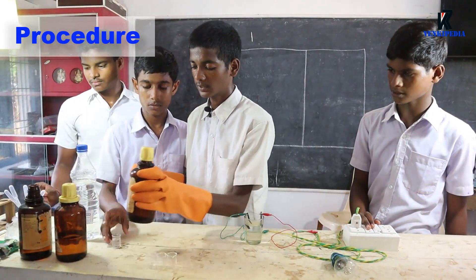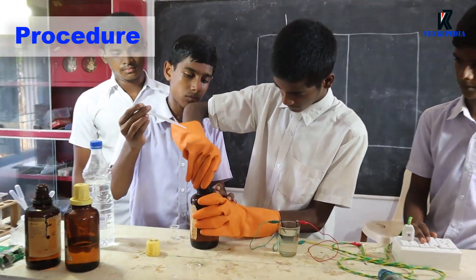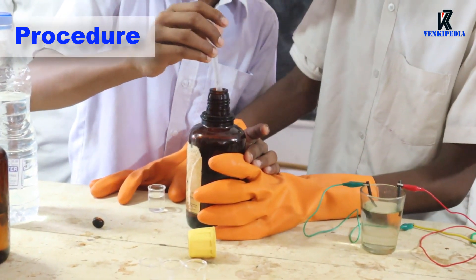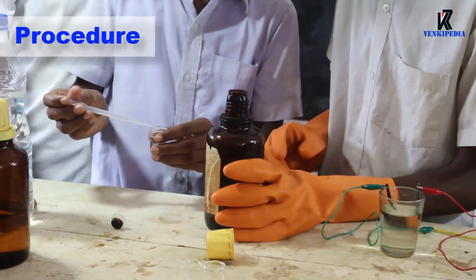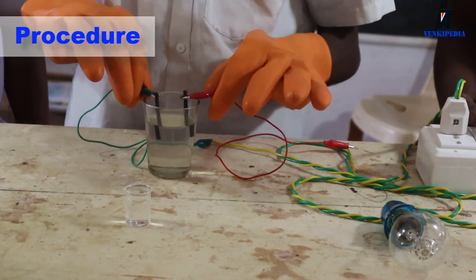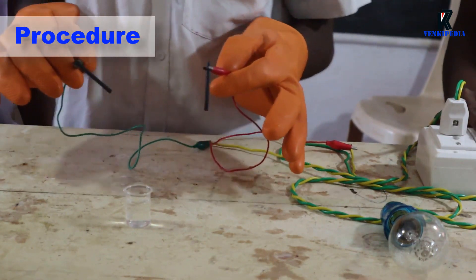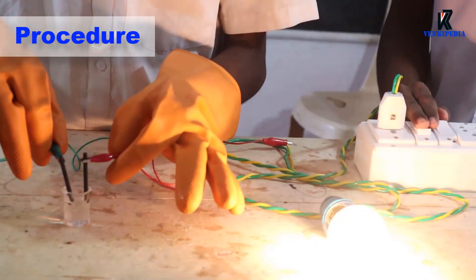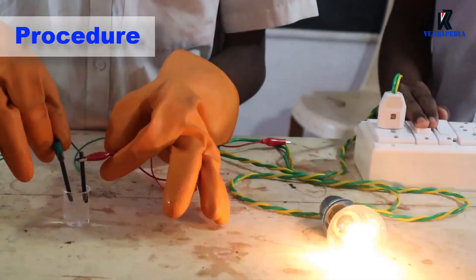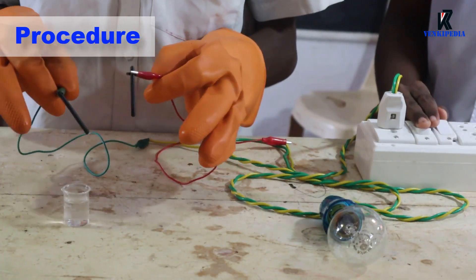Prepare dilute sulfuric acid in another beaker. Wash the graphite rods again with distilled water. Now test the conductivity of dilute sulfuric acid. We can see that dilute sulfuric acid conducts electricity as the bulb is glowing.